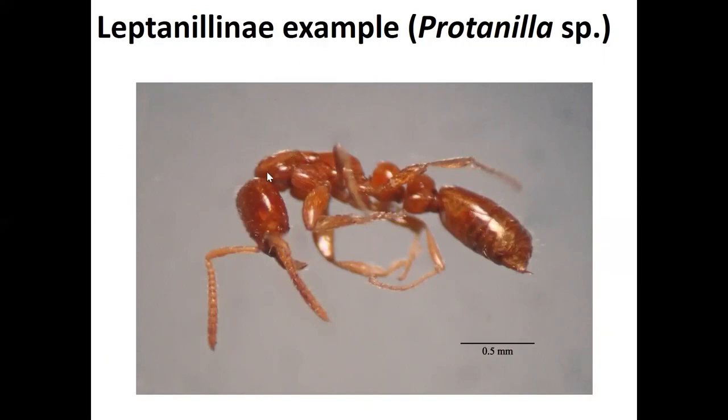So you have to observe it very clearly. You will see. I'm sorry, this is the promesonotal suture here. Well, I'm wearing spectacles, and sometimes it's not very clear, right? Okay.